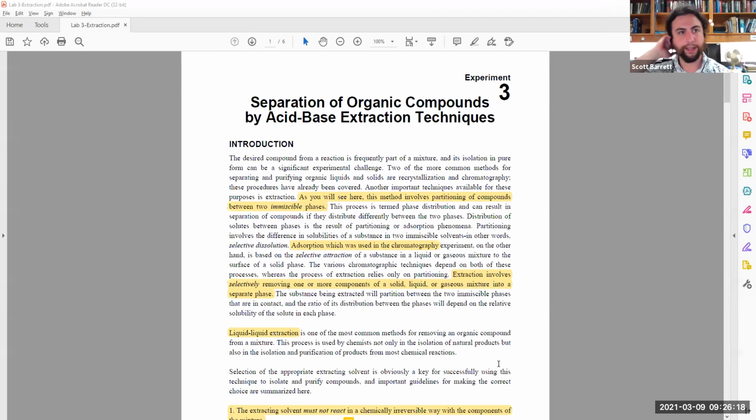Okay, all right. So this is a very great technique in chemistry because you can actually separate certain organic compounds that are not usually able to be dissolved or soluble in aqueous systems. So this is a very critical tool for performing organic chemistry. So going forward here, it's sort of reviewing what we've already covered before, recrystallization, chromatography.